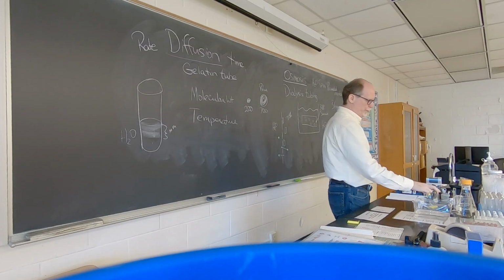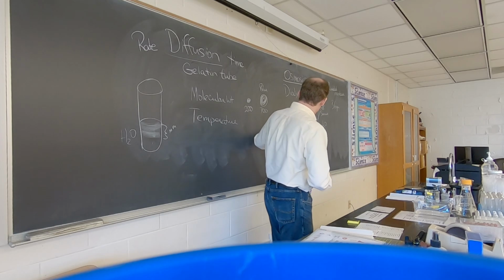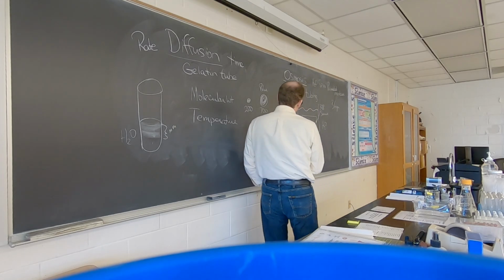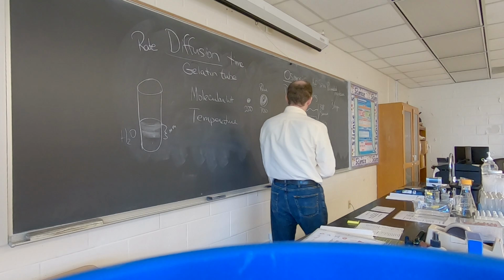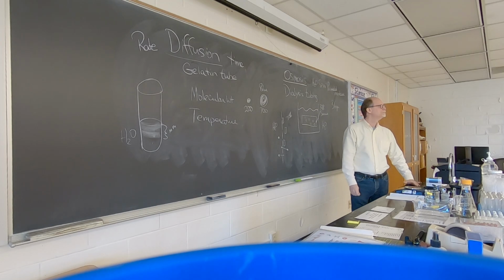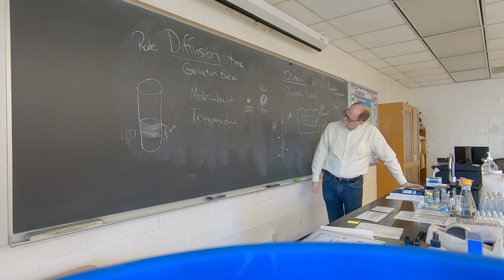So what we want to do to demonstrate osmosis, which means water molecules are moving across in and out of the dialysis tubing. So what do you think? Will more water molecules go this way into the bag, or will more water molecules go out of the bag? Well, depending on what is higher and what is lower concentration.